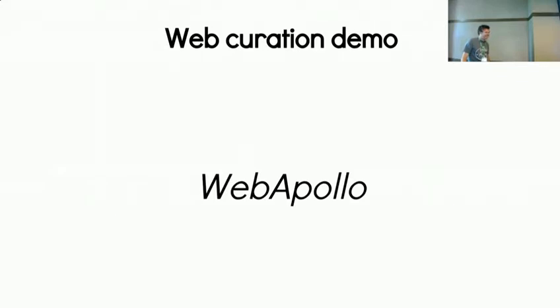No. We're aiming to. We have a cloud image that runs Galaxy and a bunch of other things, and WebApollo is something that's kind of like a pre-configured plugin on there. I have a Docker Hub image for Apollo with the most recent version. It would be nice to know before we run out.